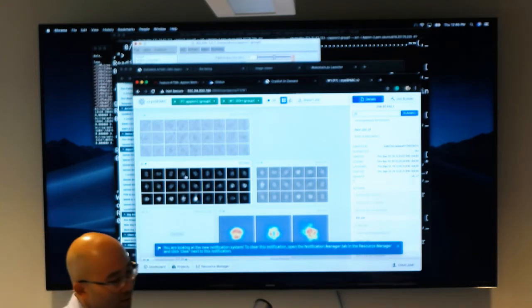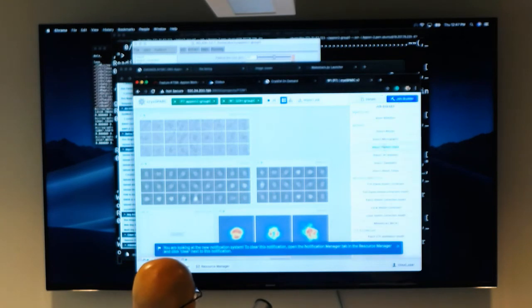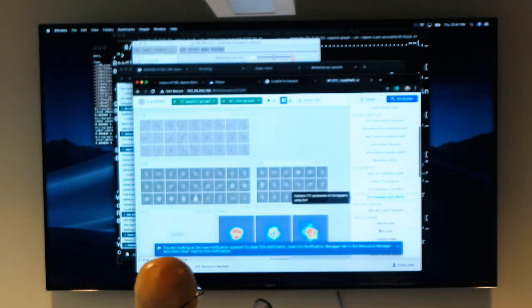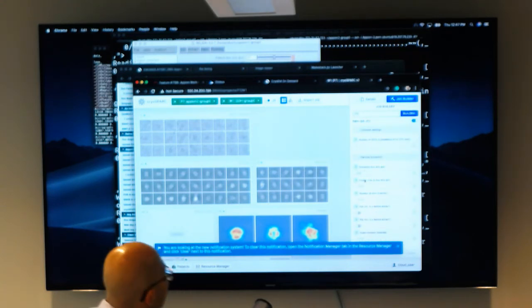In this example you wouldn't be able to do that, but normally, when you import movies, do your particle picking, and then extract from micrographs, you would specify the box size, and you could always bin to make processing more efficient.